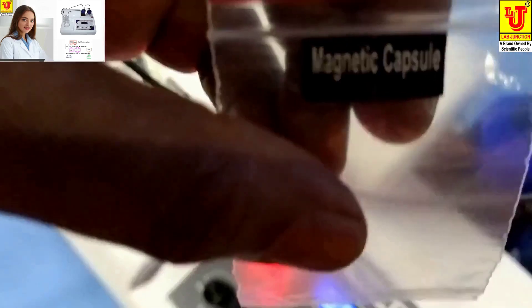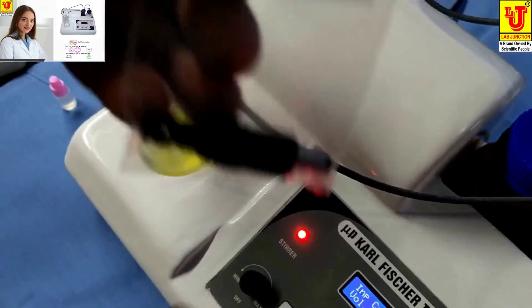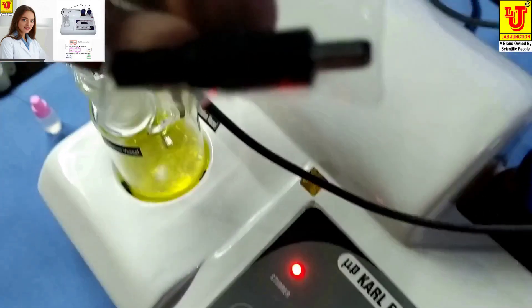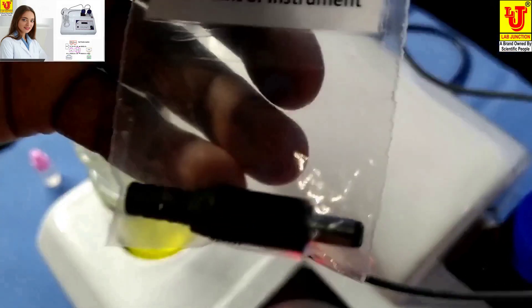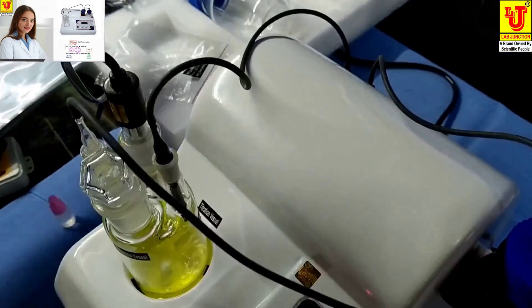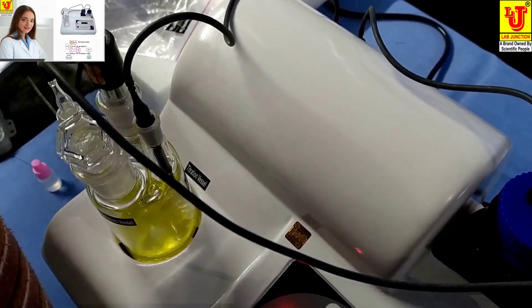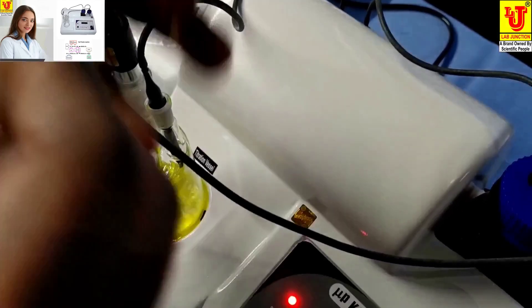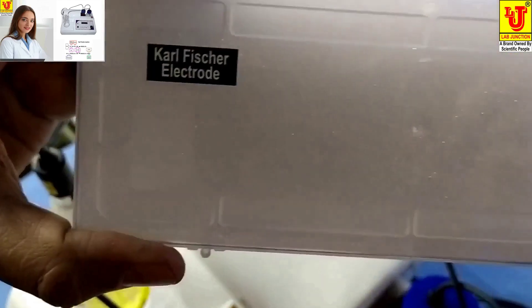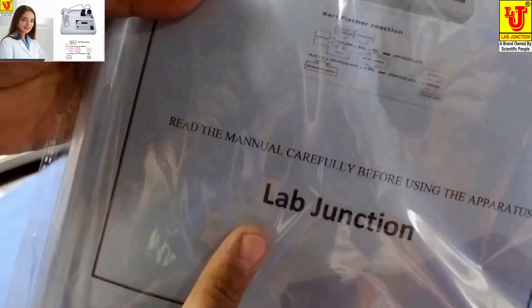One Magnetic Capsule inside the Titration Vessel, and one Black Dongle to verify the End Point of the instrument — in case of failure of the Karl Fischer Electrode, you can directly check this from the instrument. Also included: one Fuse, the Karl Fischer Electrode, and the Instruction Manual.